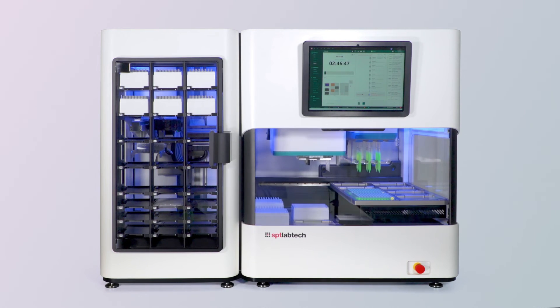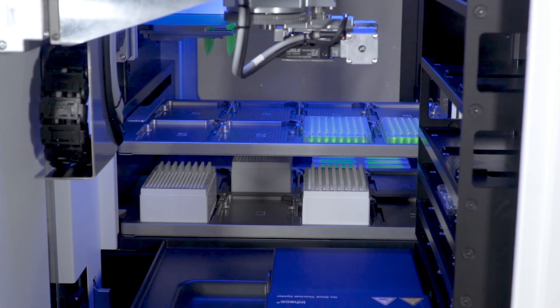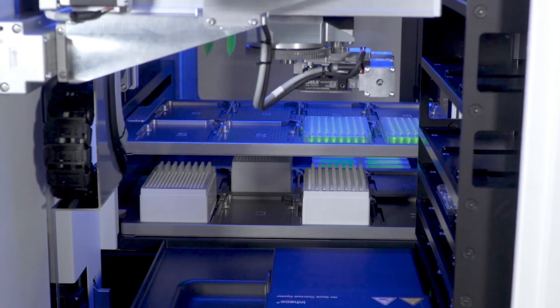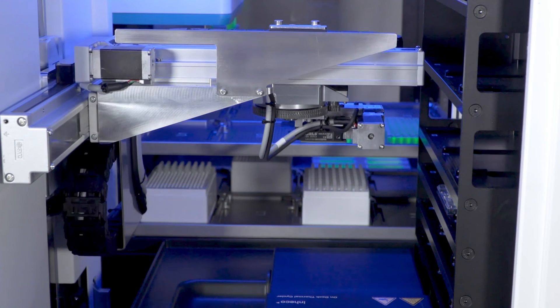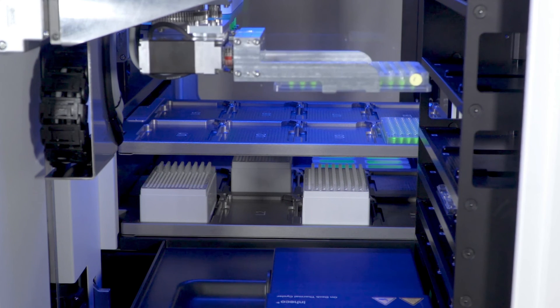Next, the pipetting head will drop off the used tips into an empty box that serves as a waste tip box. This way you can keep clean tips separate from used tips. The Firefly PLUS module will then collect the plate used earlier and place it into the shelf of the PLUS. You can see the gripper from the PLUS module seamlessly moving labware from the Firefly into the PLUS.